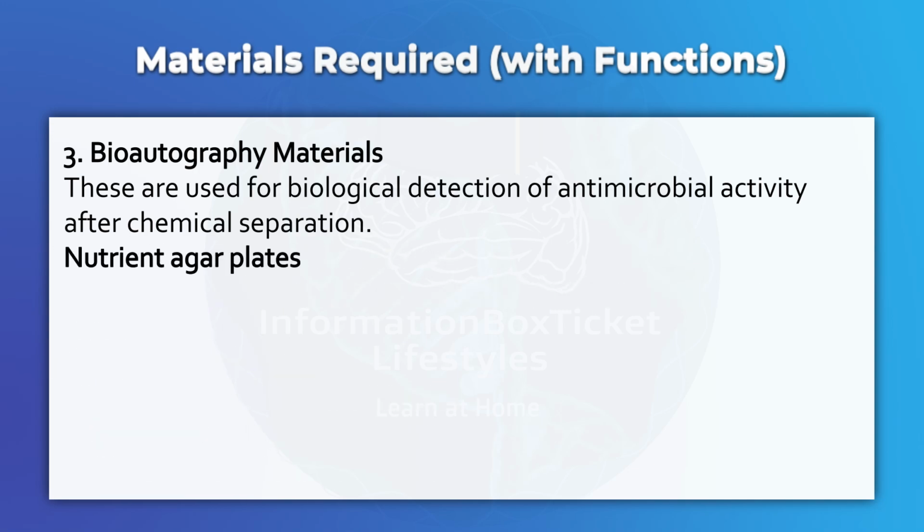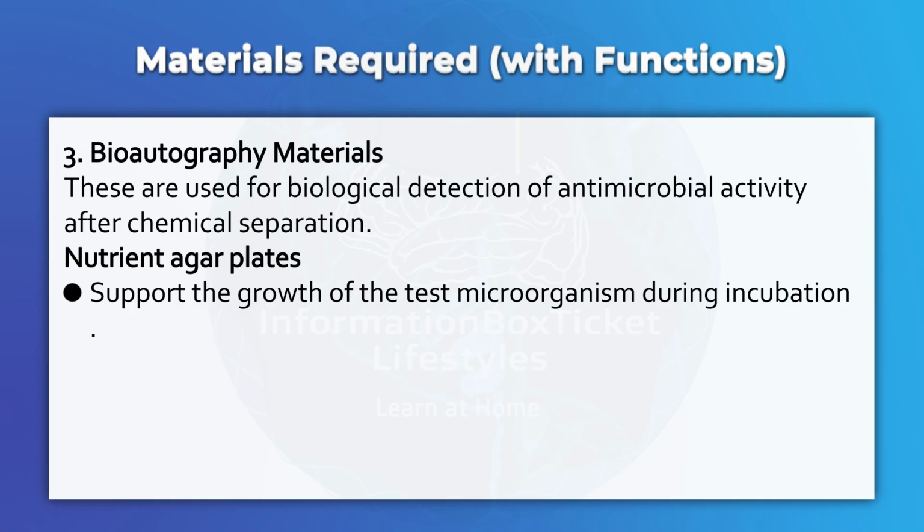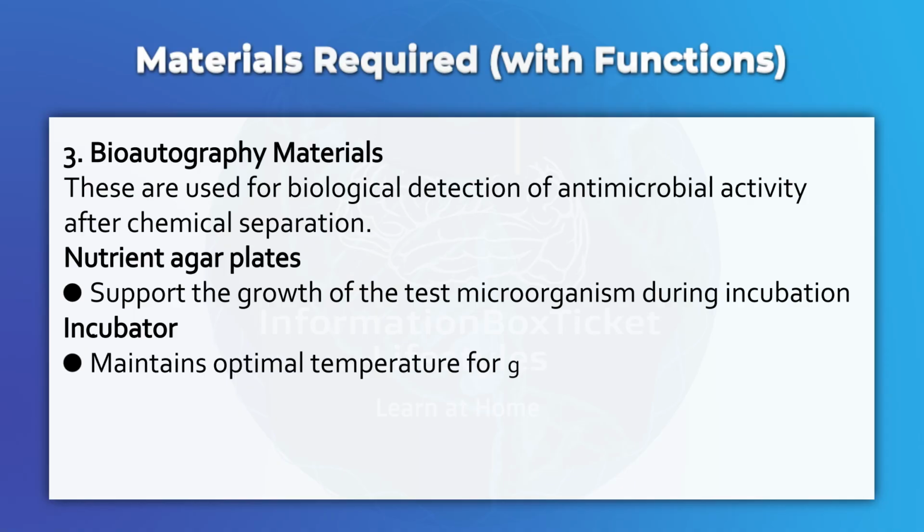Nutrient agar plates support the growth of the test microorganism during incubation. Incubator maintains optimal temperature for growth of the indicator organism.